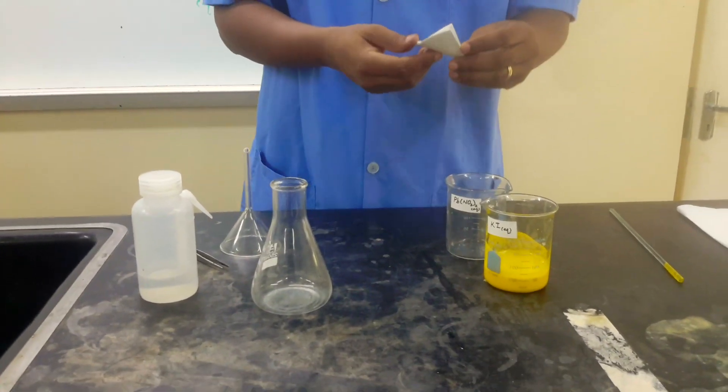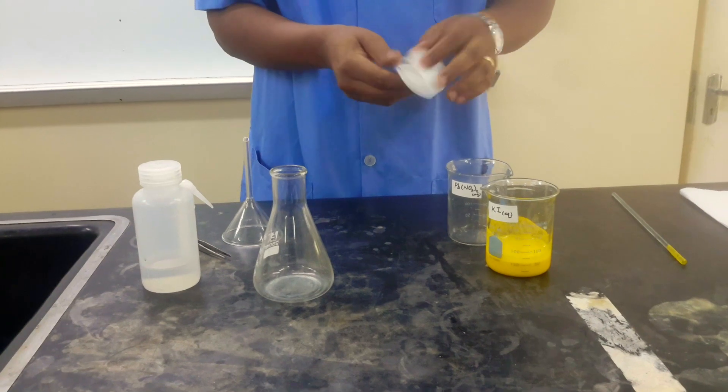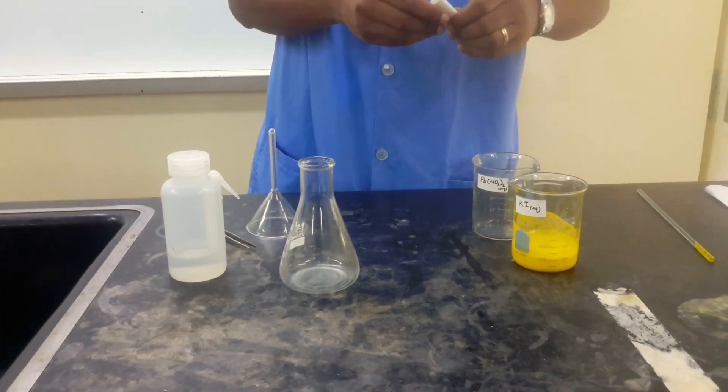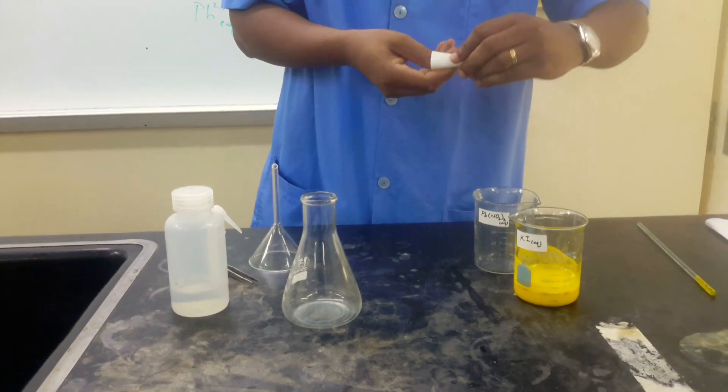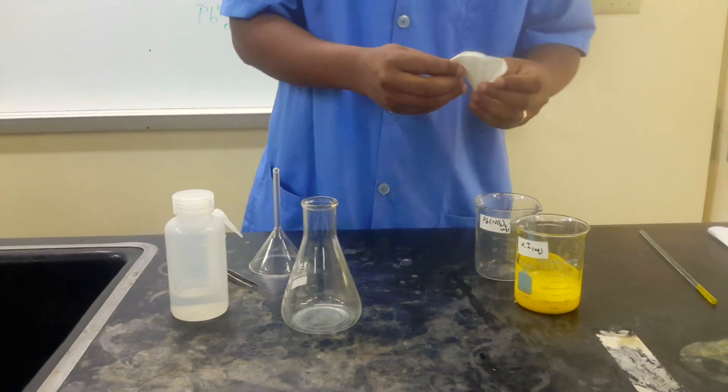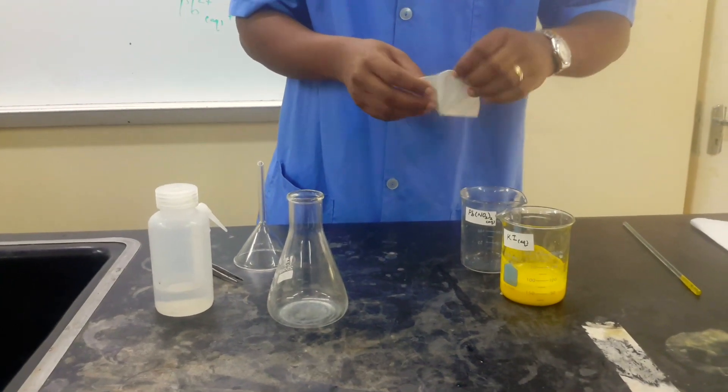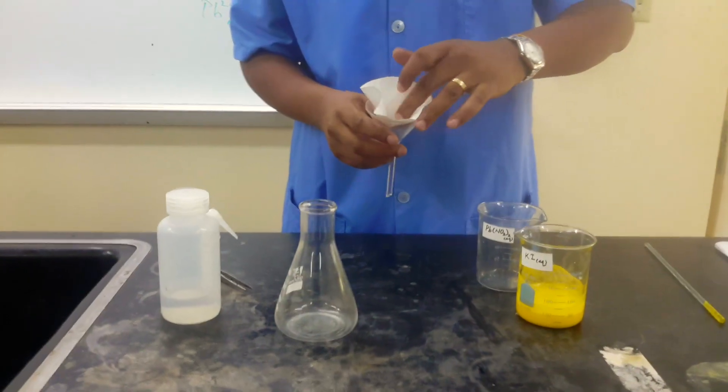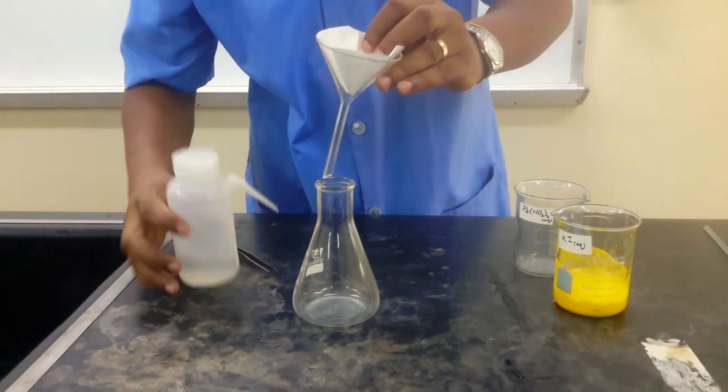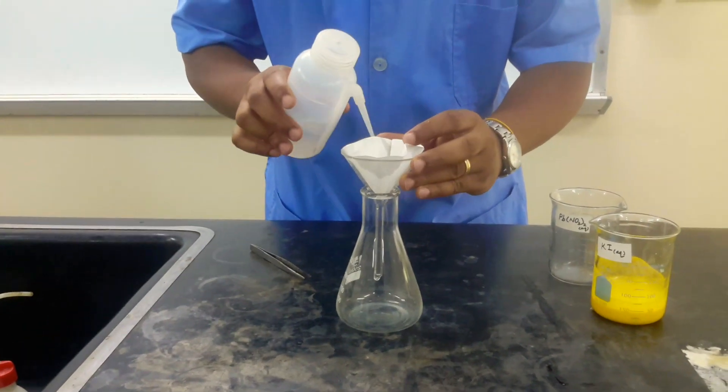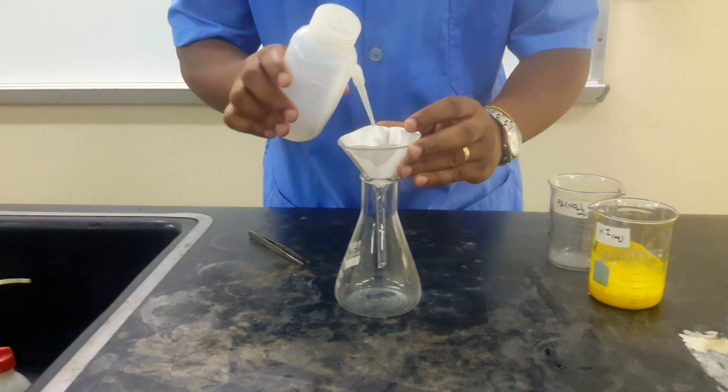So we need to have filter paper. Filter paper, we'll just fold it in half, then half again. And we can fold it in half again to fold it so we actually get a faster rate of filtration. Then we'll place this in our filter funnel, and we normally just spray it with water to help with the suction. And then pour.